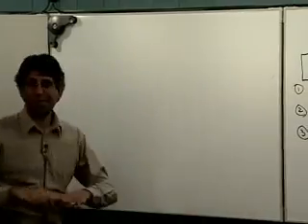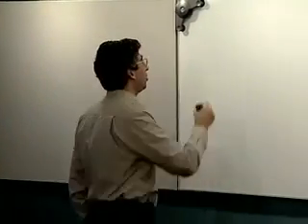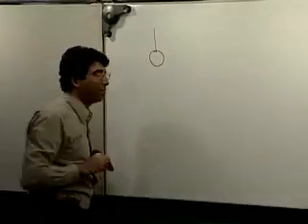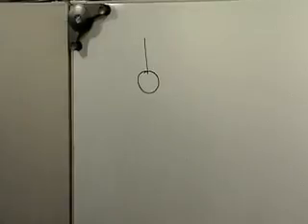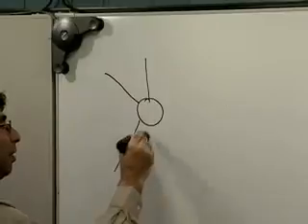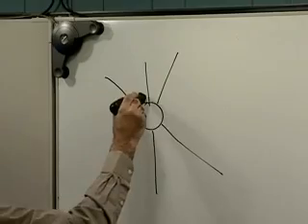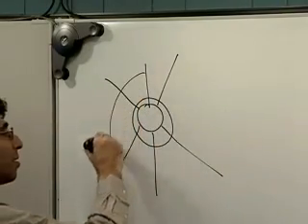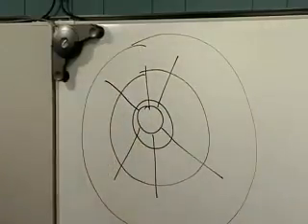So let's think about, we'll make this an easy shape, and it worked out classically. This is a good shape to use. The dropping mercury electrode, not only is it made out of mercury, but it has another big advantage. It's spherical. So let's take an electrode where the electroactive part is a little sphere, and think about the electric potential as you move out into solution away from that sphere. And you'd have lines of force, right, that would go out like that. So you'd have equipotential surfaces, etc. as you move out.